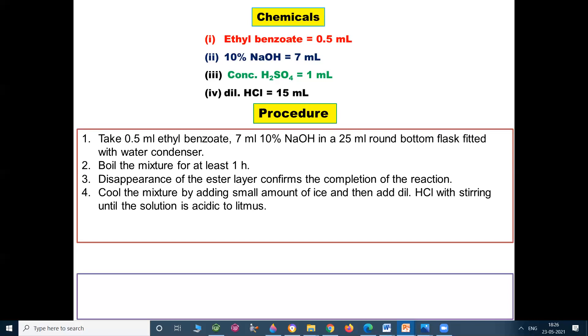Cool the mixture by adding small amount of ice and then add dilute HCl with stirring until the solution is acidic to litmus. Filter the product separated out.